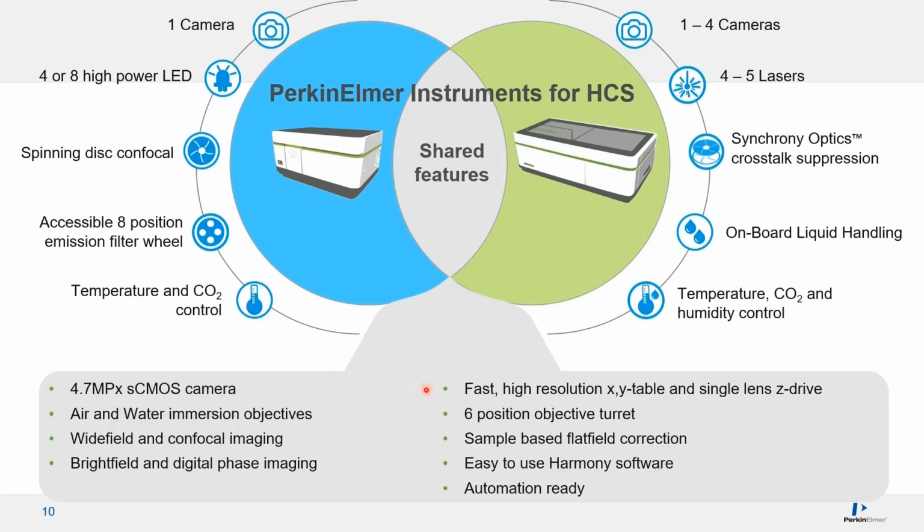And they use the same stage for XYZ image acquisition, and a total of 6 different objectives can be fitted on both systems. And they use the same software for image acquisition and data analysis, and both systems can be integrated with automation if there's a need to speed up the handling of the plates during the experiments.